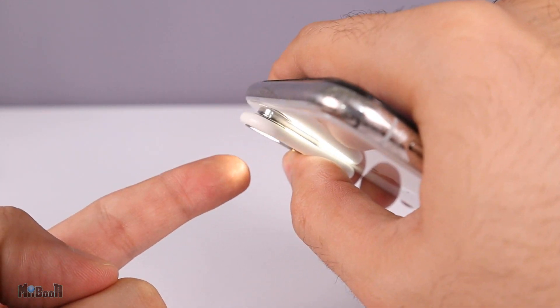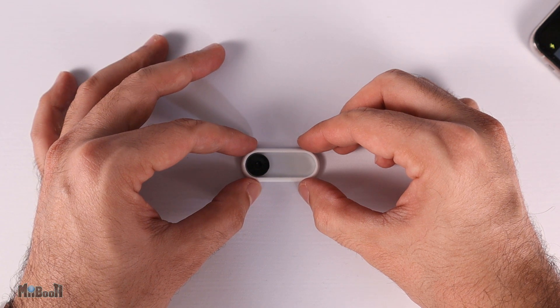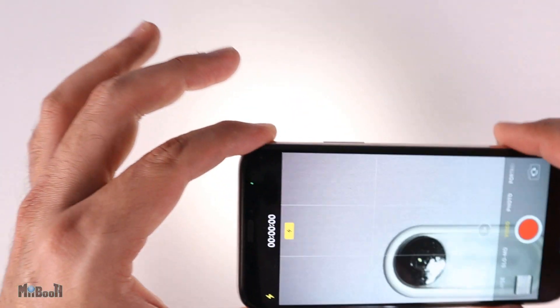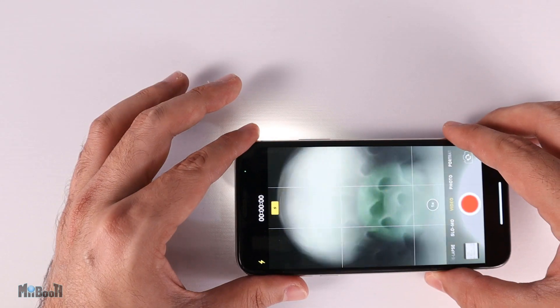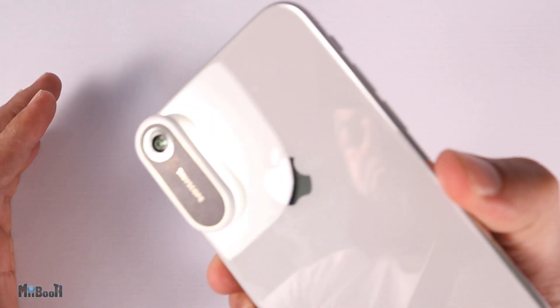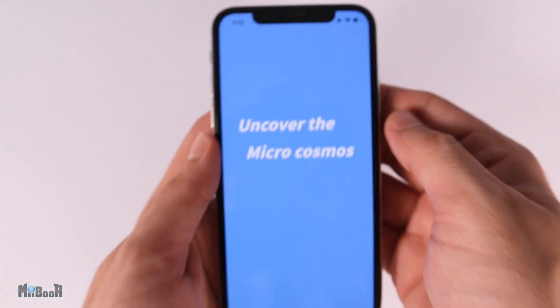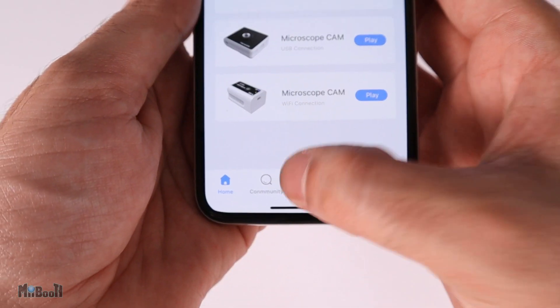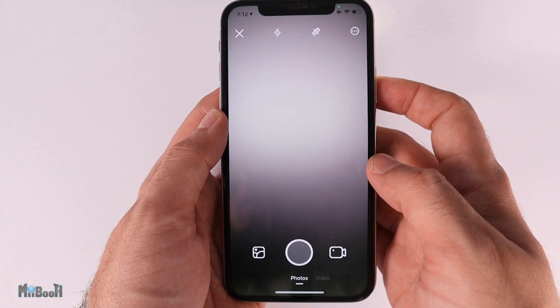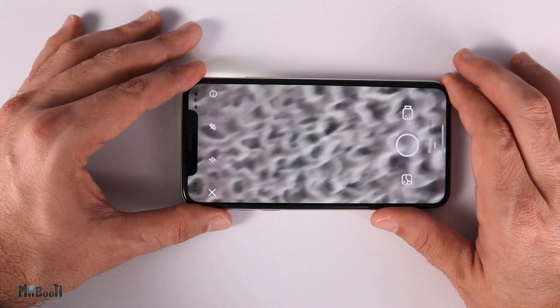To attach it, peel off the double-sided sticker and keep the microscope horizontal on a flat surface. With the camera app open and flash on, move the phone toward the scope until you see a circular image, aim for the center, and stick it on firmly. Then launch the TinyScope app — available free on the App Store and Google Play — tap the camera icon, then the microscope icon, and you're good to go. The flash automatically stays on while in the app.